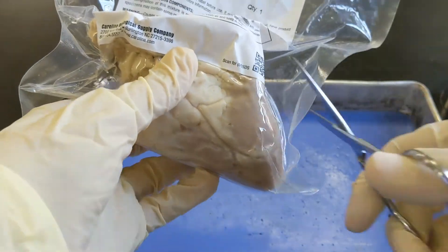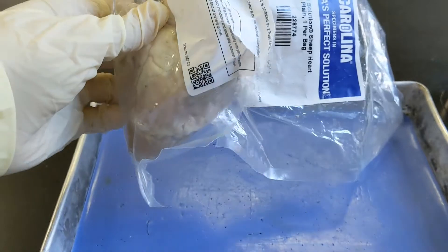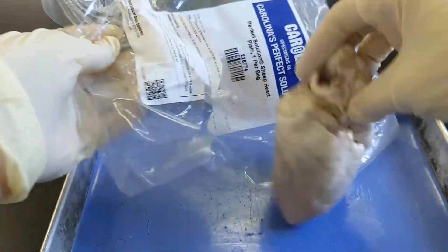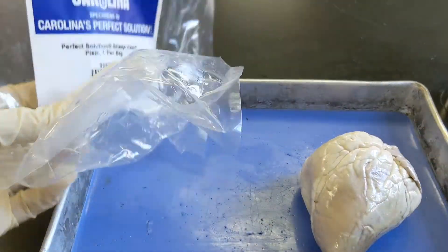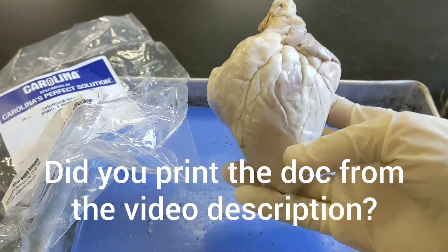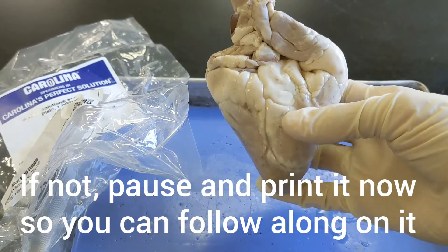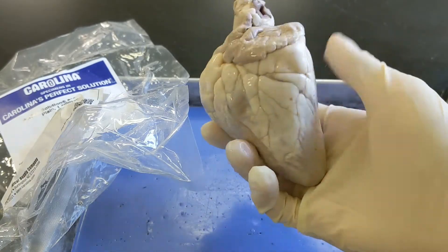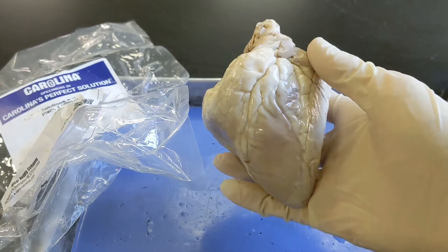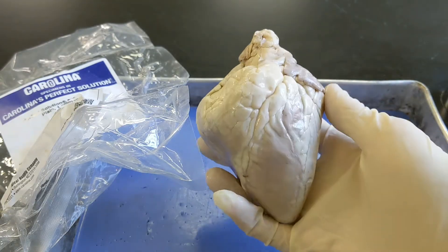I always tell my students to open the bag over the dissecting pan because sometimes there are some juices, and it's better for those to go into the pan. This one's not particularly juicy. When you look at the heart, the very first thing you need to do is determine what is the front or anterior part of the heart and what's the back or posterior part of the heart.